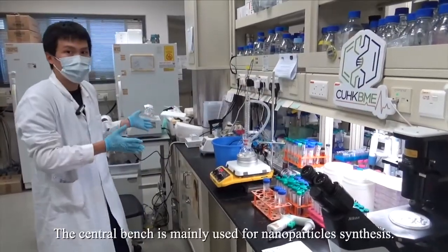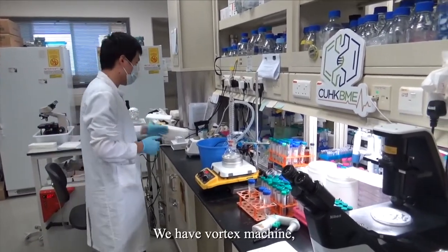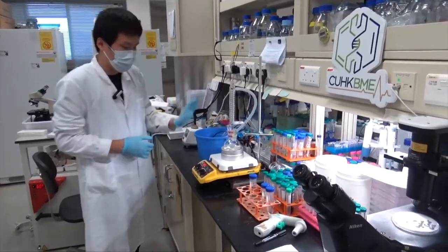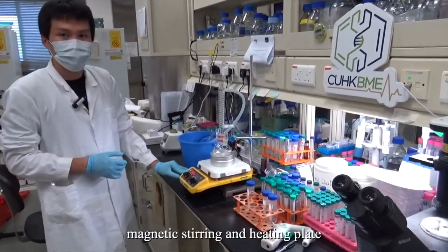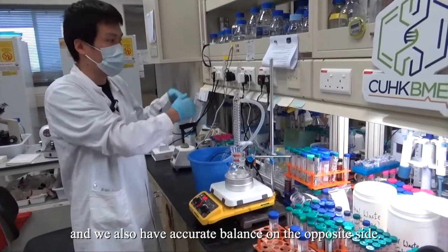The central bench is used for nanoparticle synthesis. As you can see, we have a vortex machine, magnetic stirring and heating plate, and we also have some accurate balance on the opposite side.